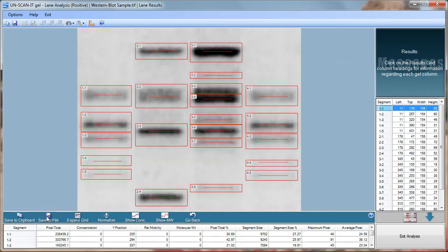After all the bands have been analyzed the results screen will be displayed. Clicking the column headings will display a description of the data in that column.